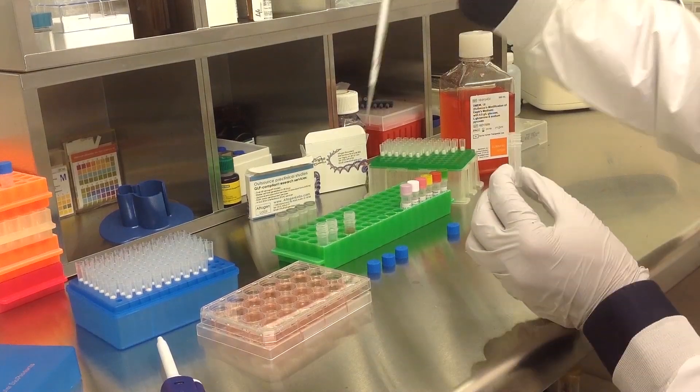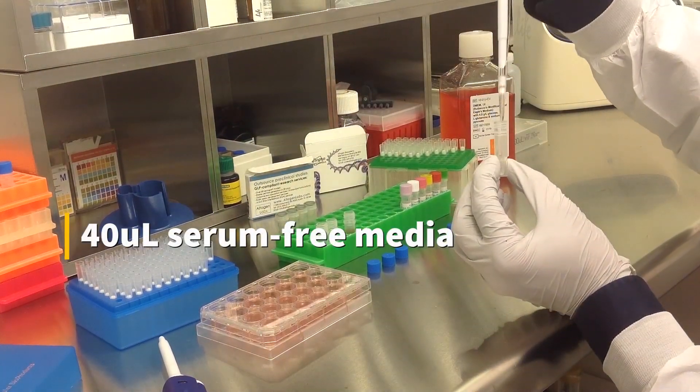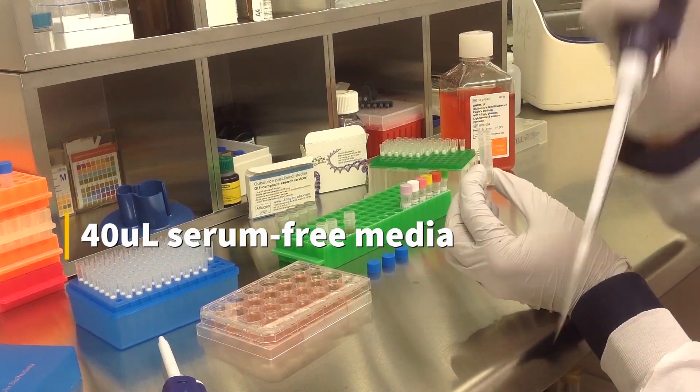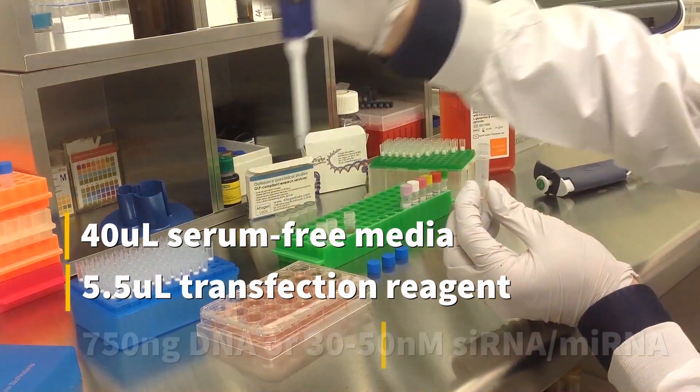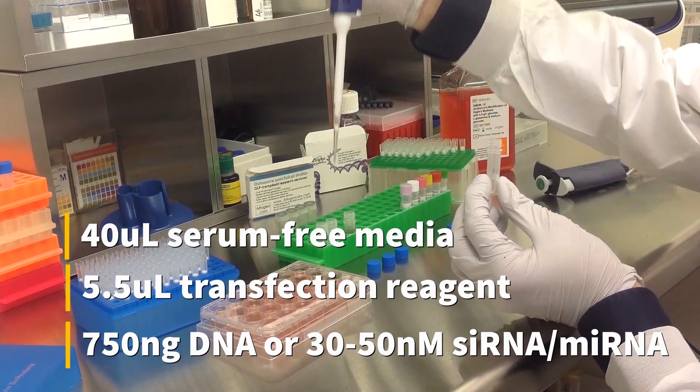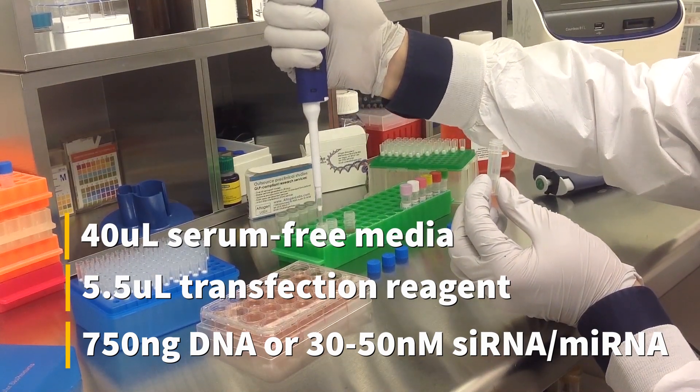To prepare the transfection complex, mix 40 microliters of serum-free medium and 5.5 microliters of transfection reagent, along with either 750 nanograms of DNA or 30 to 50 nanomolar siRNA or microRNA.